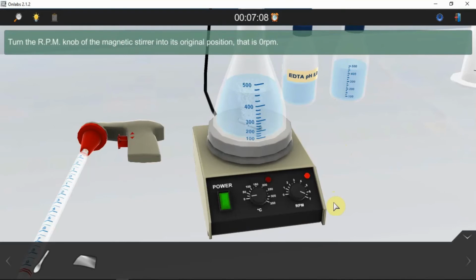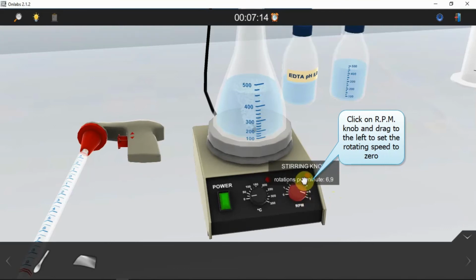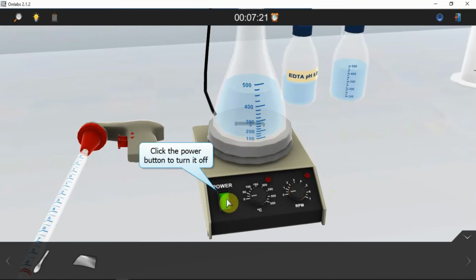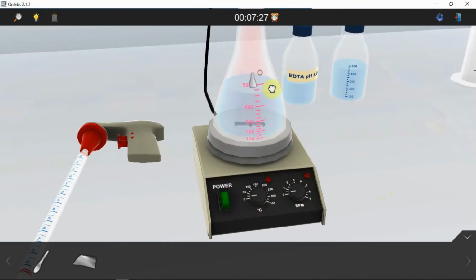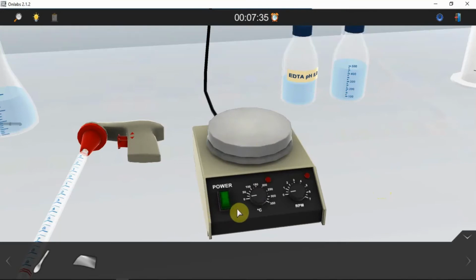Turn the RPM knob of the magnetic stirrer back to its original position, that is 0 RPM. Well done. Turn off the magnetic stirrer. Well done. Put the Erlenmeyer flask back on the bench. Well done. Remove the magnetic stir bar from the Erlenmeyer flask with the use of the magnetic stick.